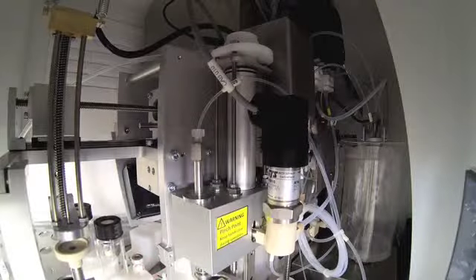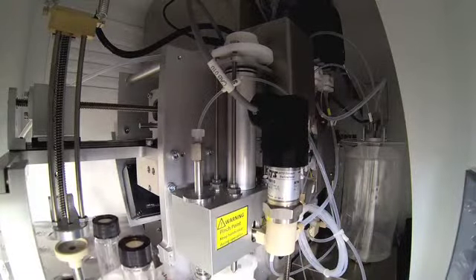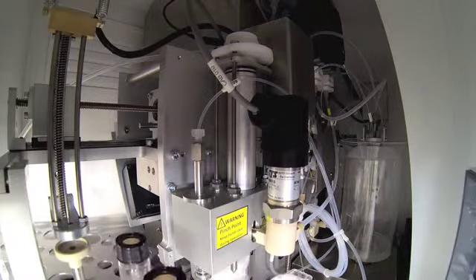Furthermore, automated sample preparation reduces the analyst chemical and sample exposure, greatly improving laboratory health and safety.